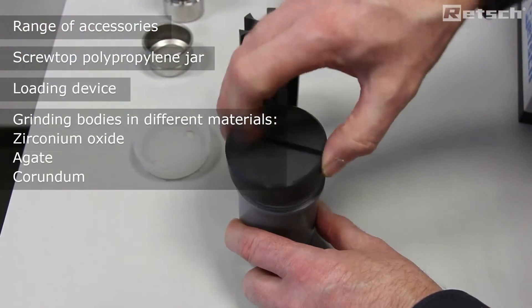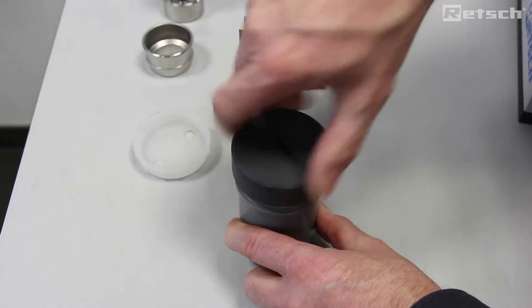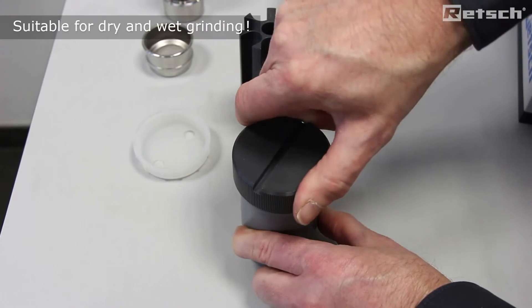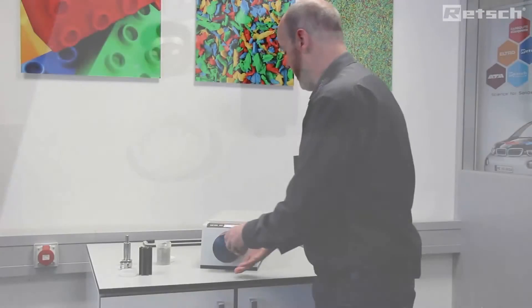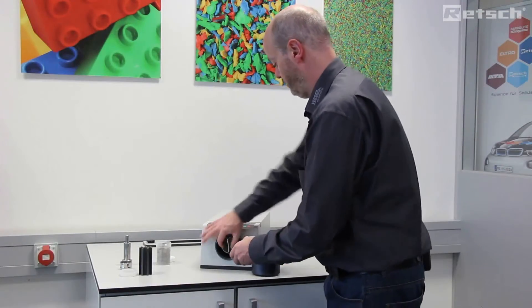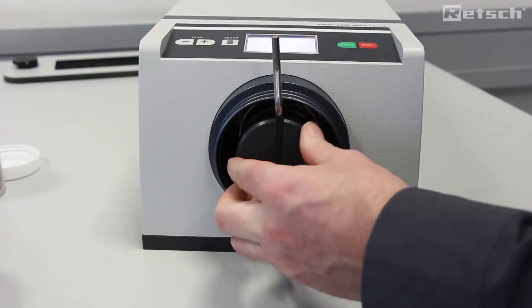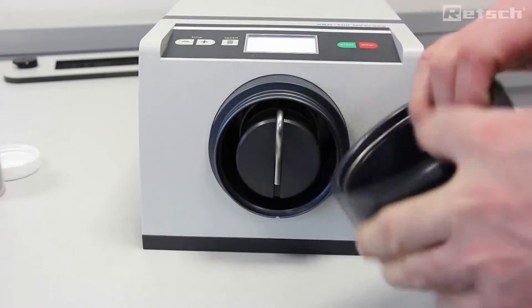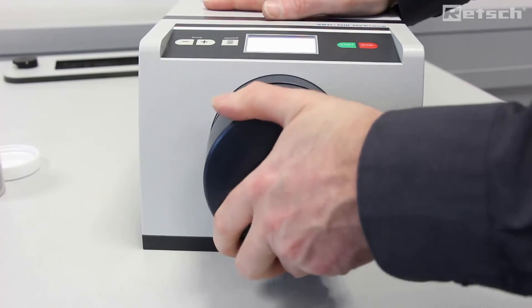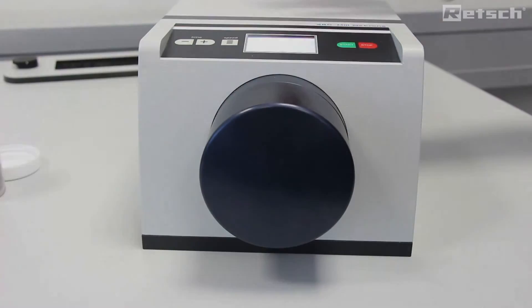We simply load up the cylinder with the guide, add the material to be ground, tighten the cap, and load the cylinder up. The sample is now ready to be run.